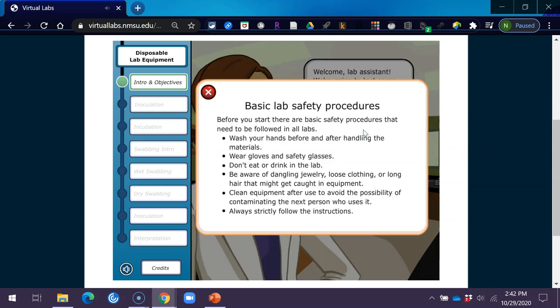Basic Lab Safety Procedures. Before you start, there are basic safety procedures that need to be followed in all labs. Wash your hands before and after handling the materials. Wear gloves and safety glasses. Don't eat or drink in the lab. Be aware of dangling jewelry, loose clothing, or long hair that might get caught in equipment. Clean equipment after use to avoid contaminating the next person. Always strictly follow the instructions.